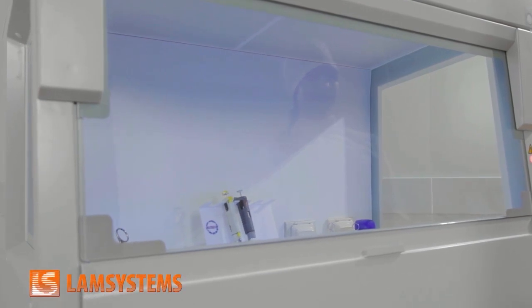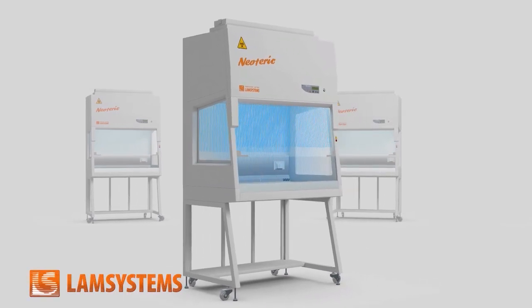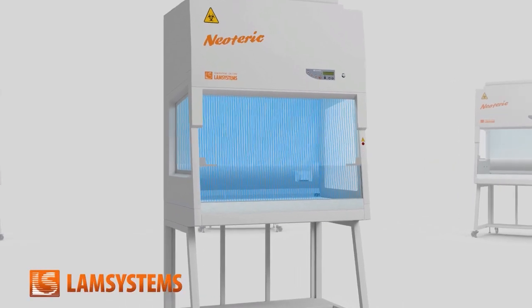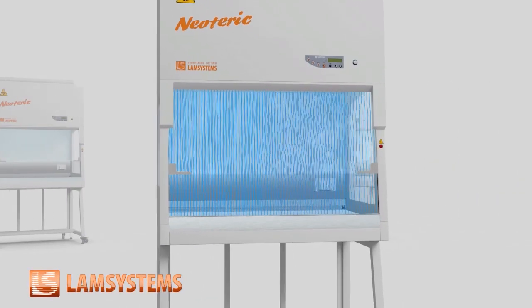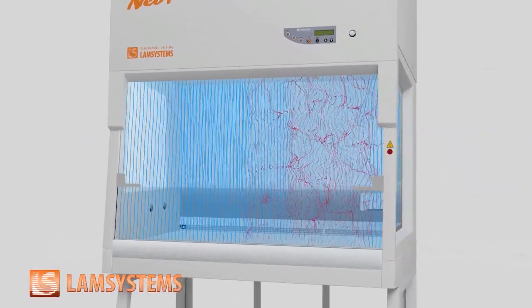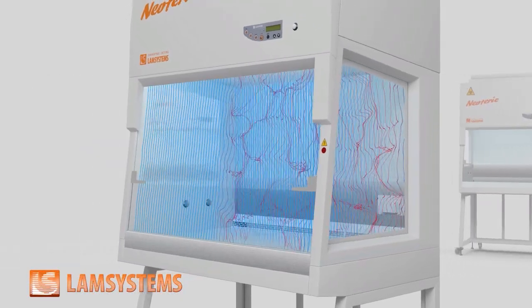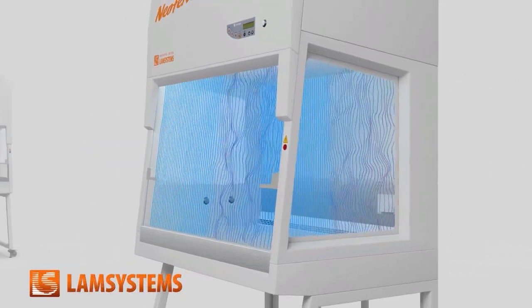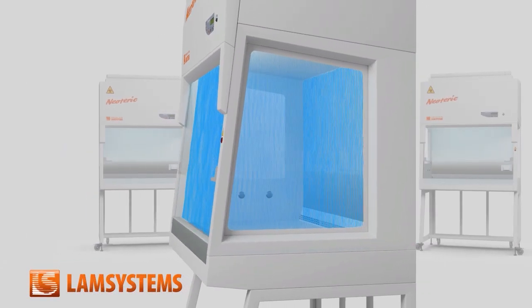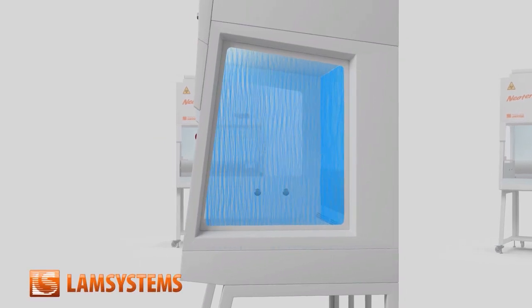A bit of theory. There are 2 kinds of airflow. The first is laminar, when the air flows in parallel layers with no disruption between the layers, and the second is turbulent, when along the flow there is an intensive vortex activity and a mixture of air layers. The airflow in the second-class biosafety cabinets must be laminar. This is necessary to protect products from cross-contamination.